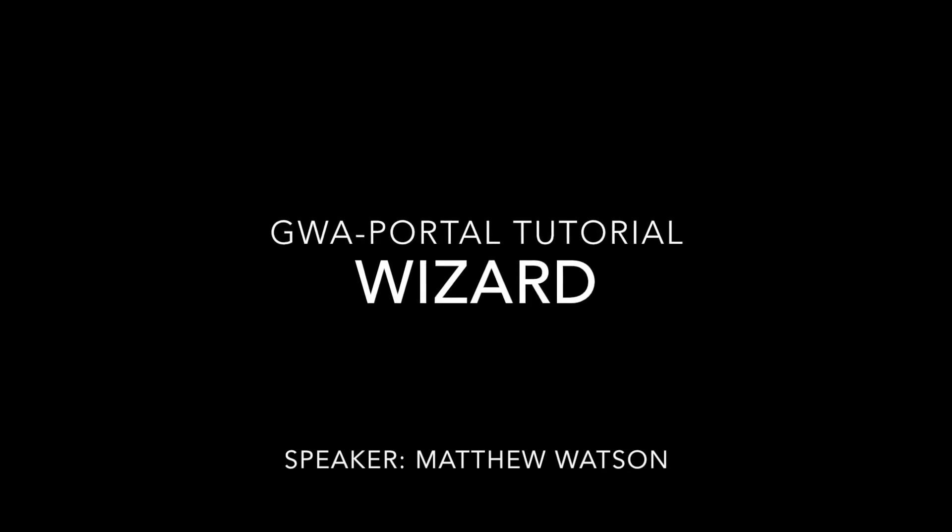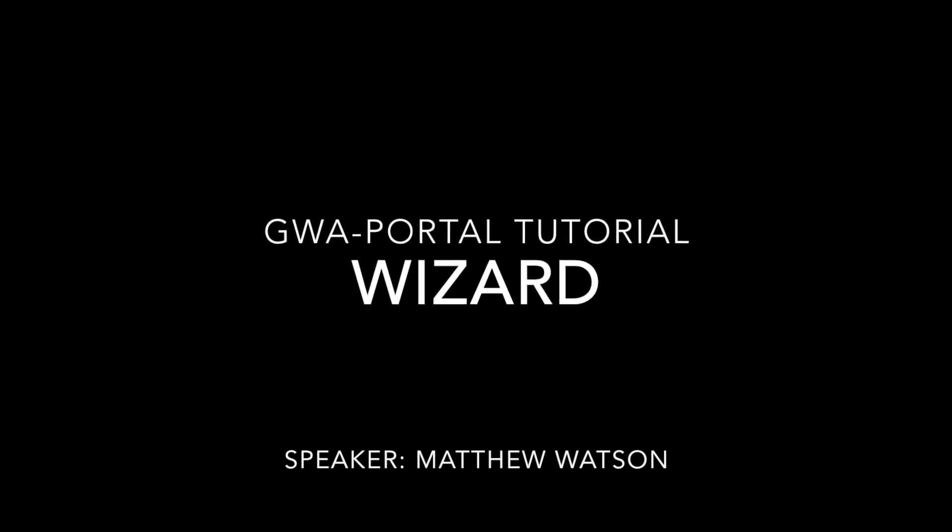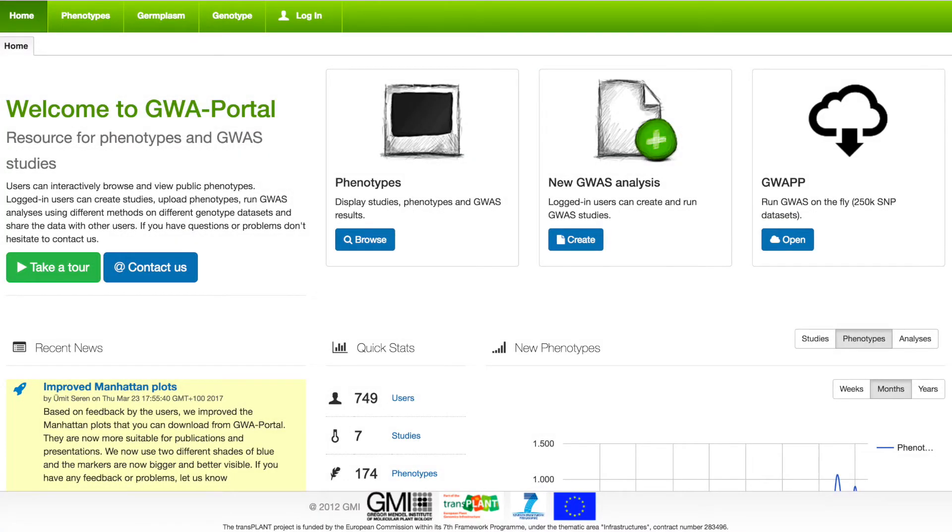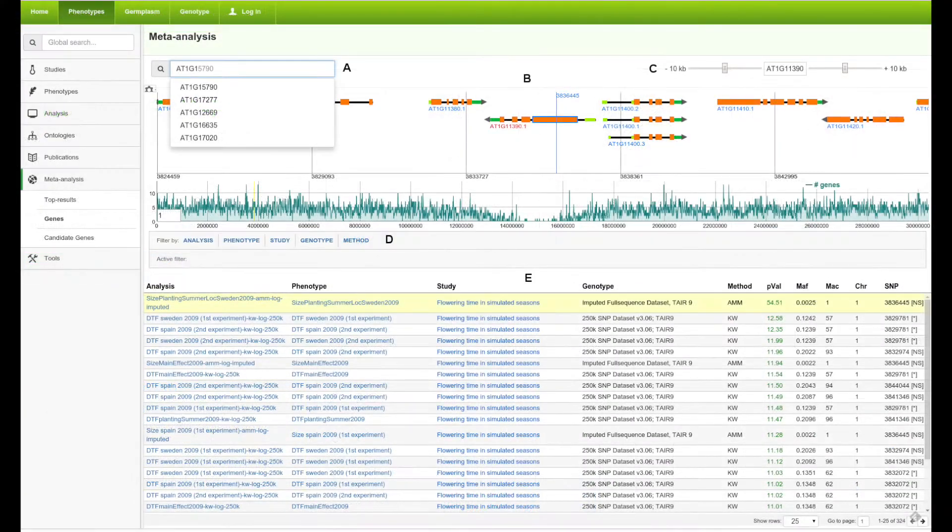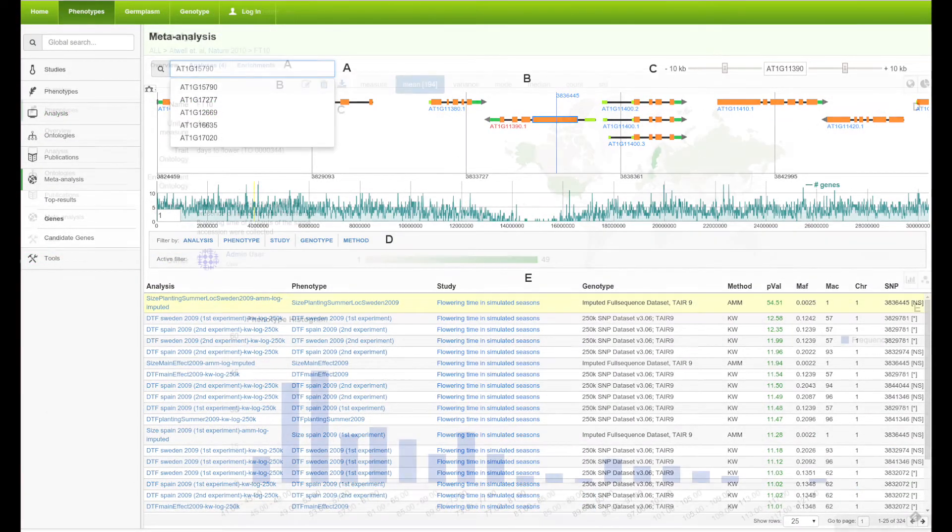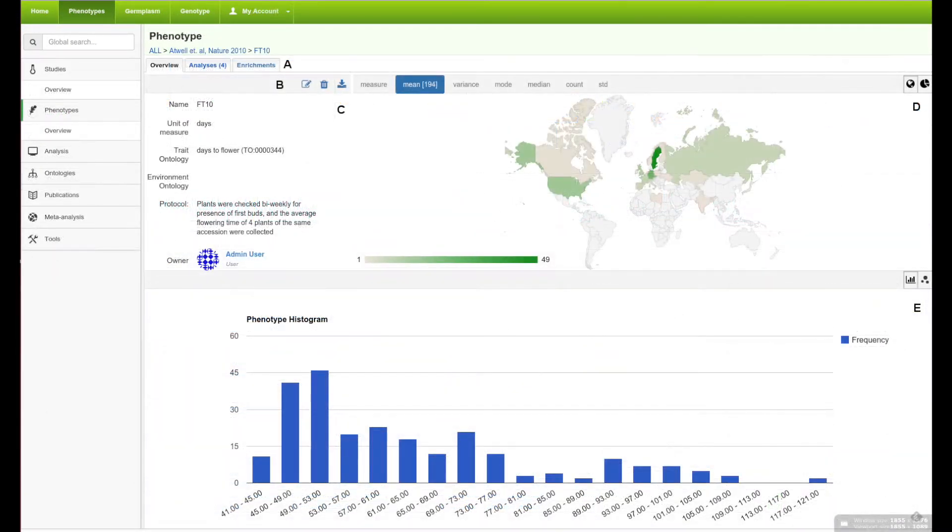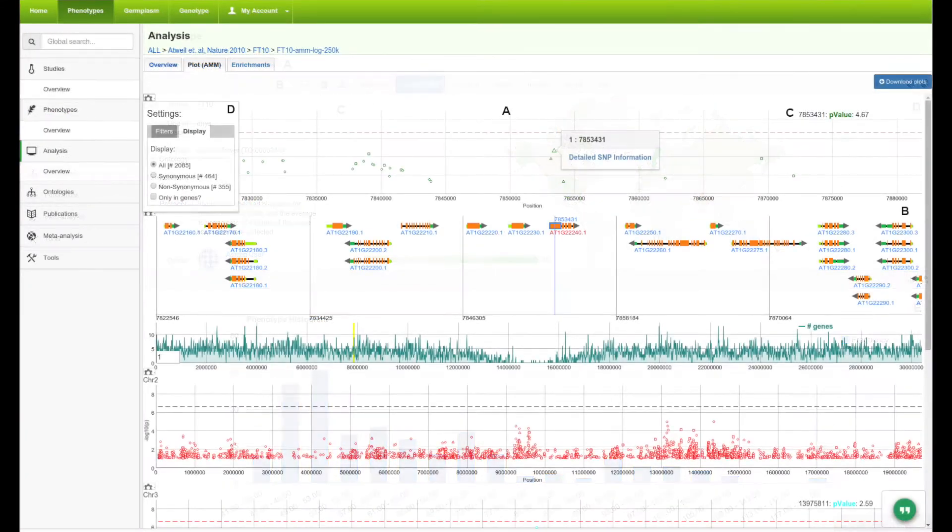The GWAS Portal is a tool for Arabidopsis researchers to easily perform genome-wide association studies. It is a repository of genotypes, phenotypes, and genome-wide association study results.